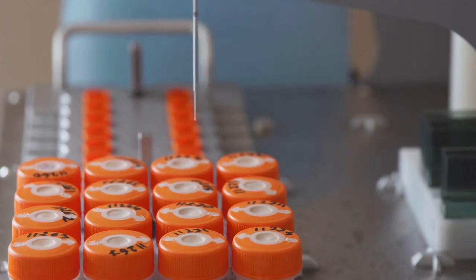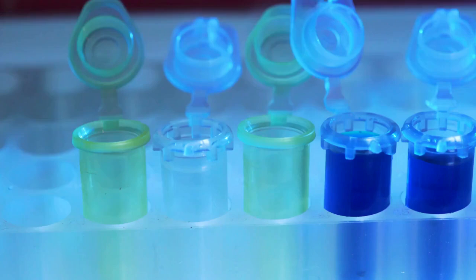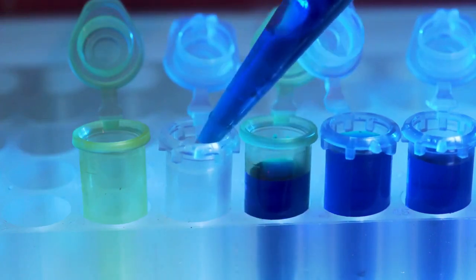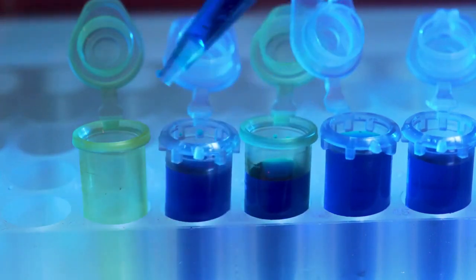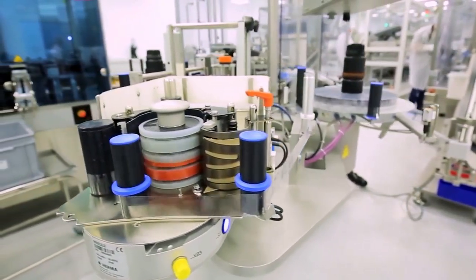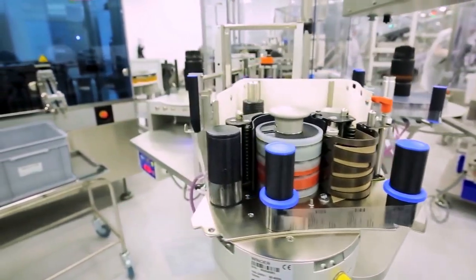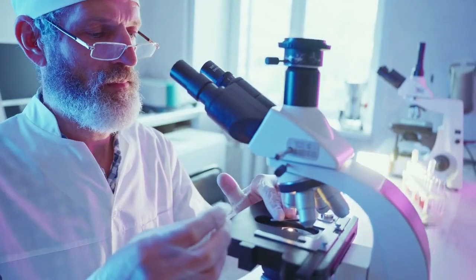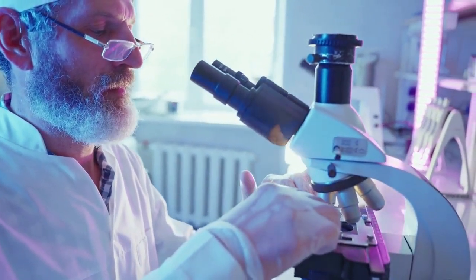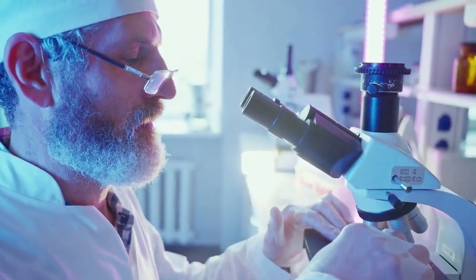First, you need to look at your chromatogram, which is the graph produced by the GC instrument. This graph has several peaks, and each peak represents a different chemical compound that was in your injected sample. The largest peak is almost always your main product, the compound you are interested in. All the other, smaller peaks typically represent impurities. The most crucial piece of information your GC software provides is the area under each peak. This is usually found in a data table next to the chromatogram.